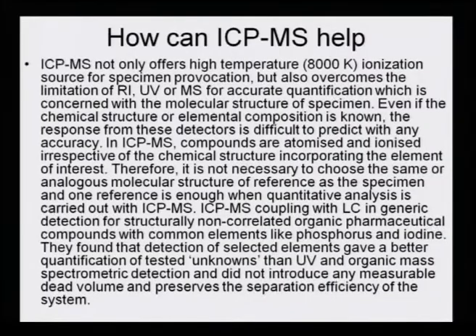So, it is now very clear why LC-MS lags behind and why ICP is a step ahead of LC-MS. The simple reason is that here we are not concerned with the molecular entity. What is the structural detail? Because whatever be the structural detail, it can identify, quantify and give a very precise data.